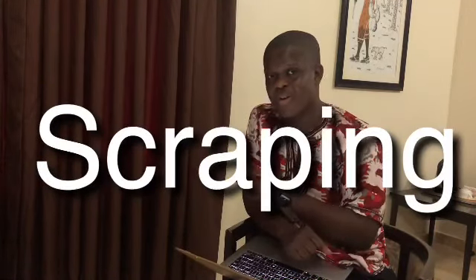And when you understand that we are actually scraping, sample collection for pap smear requires scraping. We are using a tool to scrape the outer portion of the cervix. We use a spatula. Some call it a spatula, some use the terminology cervical spatula, because there are different spatulas for every purpose. So that is a kind of force, active agitation using a mechanical structure. So that is mechanical exfoliation.